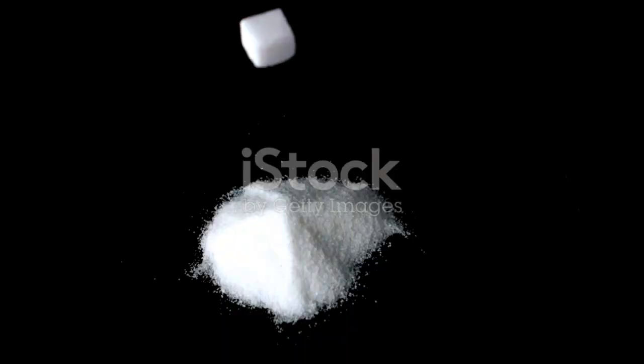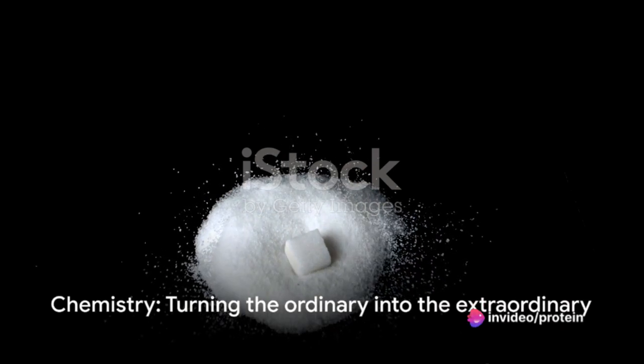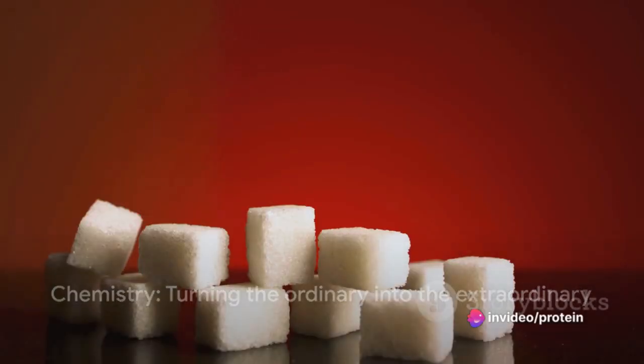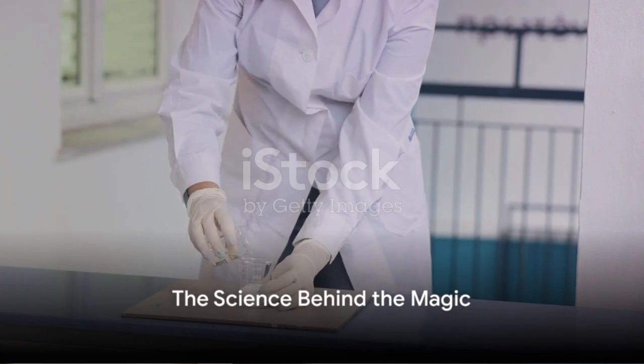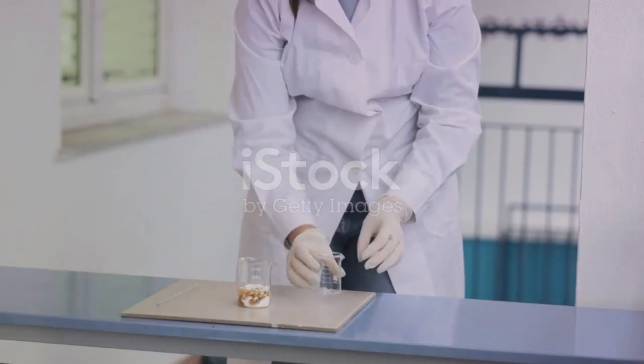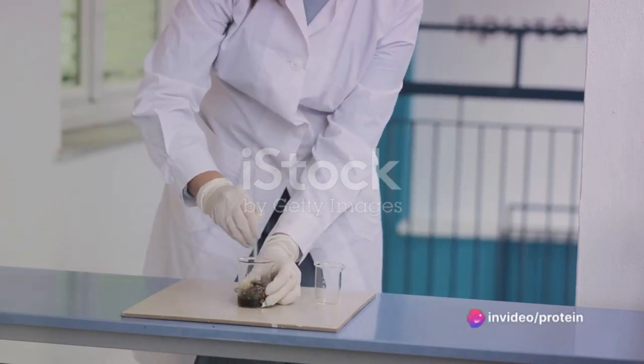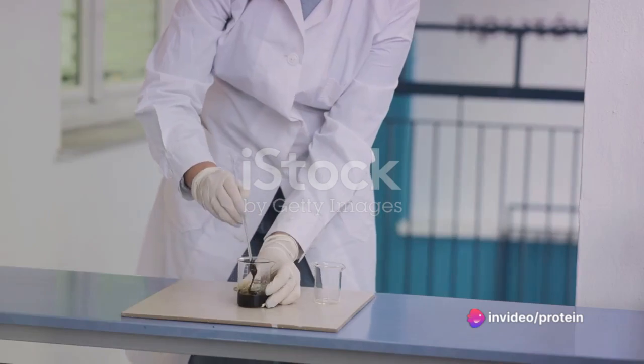By the end of the reaction, the sugar cube will have transformed into a tower of black carbon. Mesmerizing, isn't it? That's the power of chemistry, turning the ordinary into the extraordinary. In summary, the experiment demonstrates a fascinating chemical reaction where sulfuric acid dehydrates a sugar cube, releasing heat, breaking down the sugar into its components, and eventually leaving a mass of black carbon.